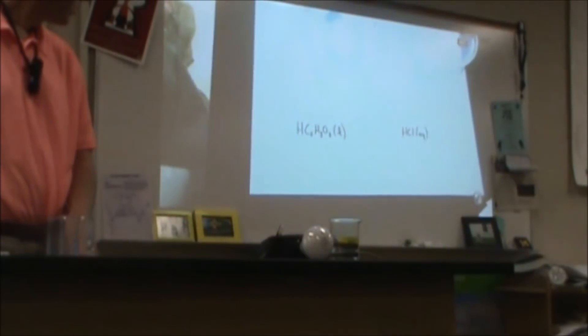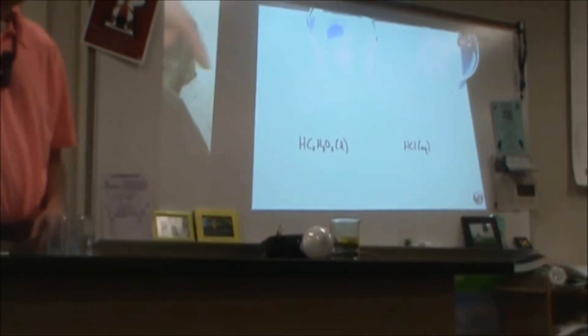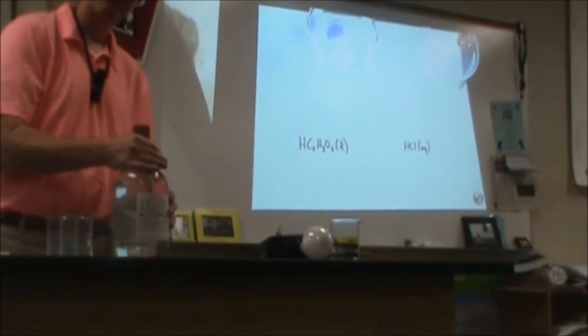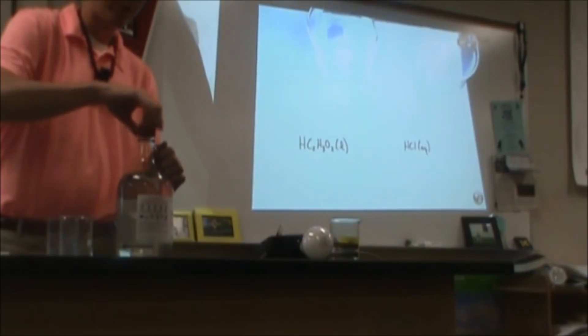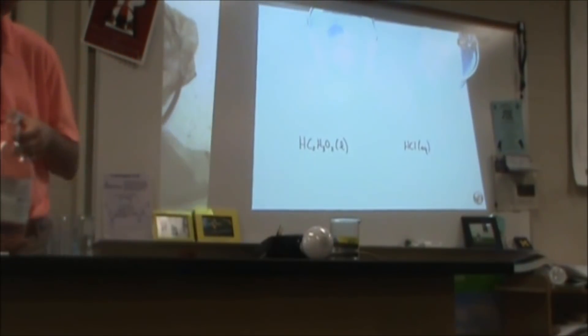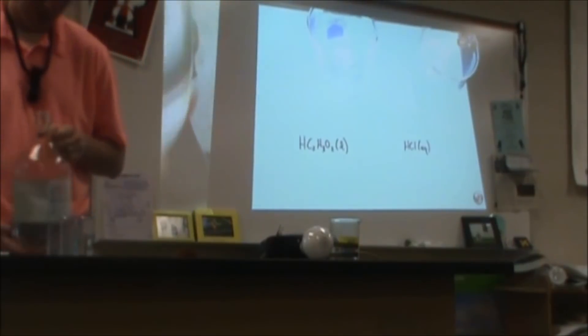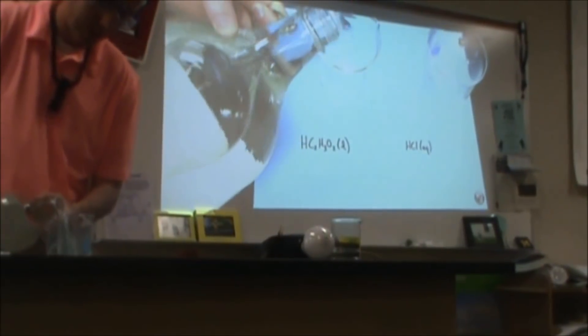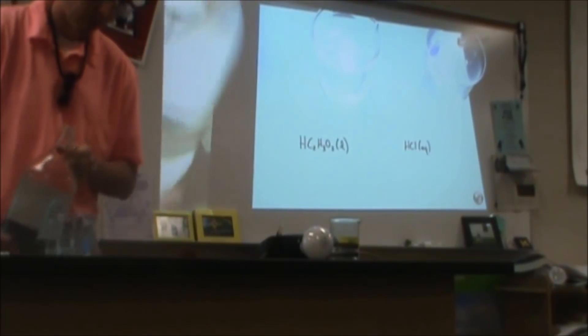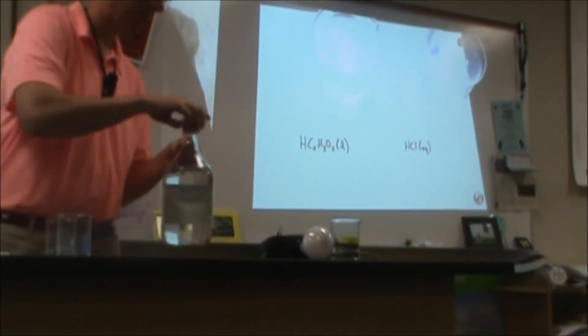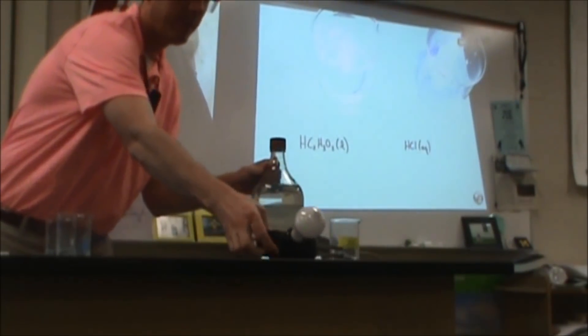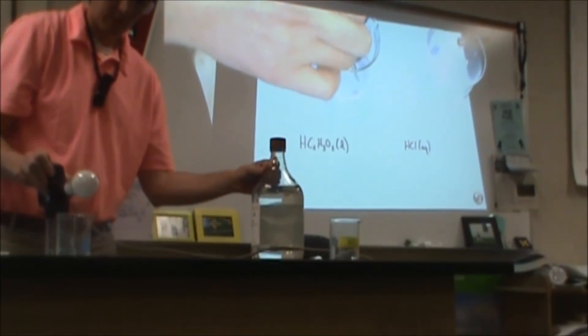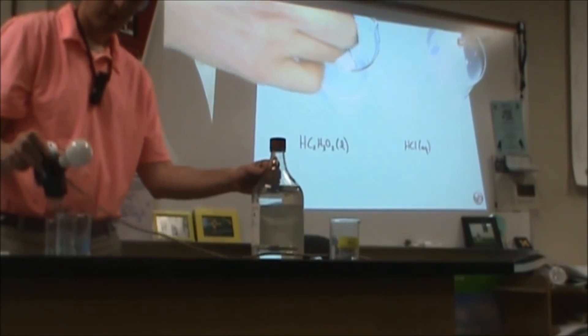For the second one here, we want to look at the same things, but for acids. Here I've got some glacial acetic acid, acid with no water. Acid with no water is not really an acid, because it takes a base in order to create an acid. As long as there's no water present in here, then this is going to be in a molecular form. There are not going to be charged particles. When I dip the light bulb into that, nothing's going to happen. You can see that that doesn't light up.